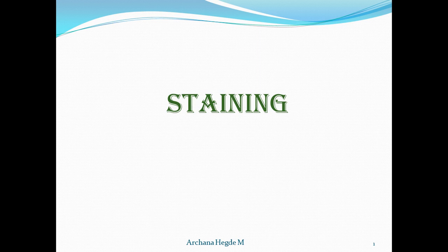Hello friends, I am Archana Hegde and today's topic is staining. Staining is a very beautiful technique or method of microbiology where the microorganisms are stained and they look very beautiful under the microscope. Microorganisms are tiny creatures which cannot be seen with the naked eye, so they are seen under the microscope in different resolutions: 10x, 40x, 100x or the oil emersion field.